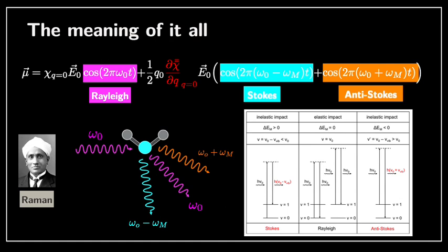But what matters really is that this technique interrogates the vibrations of the material. And the vibrations of the material, of course, are intrinsic properties of the material. Therefore, we can measure properties.